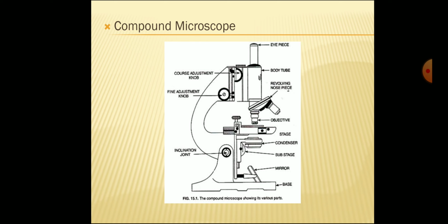This image is taken as an object for an eyepiece. The eyepiece further magnifies this primary image into a virtual, erect, enlarged image. This is the final image that lies above the stage. As the primary image falls within the focus F of the eyepiece, it forms a virtual erect image.